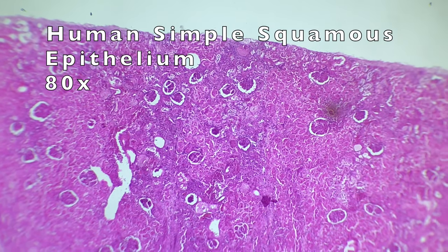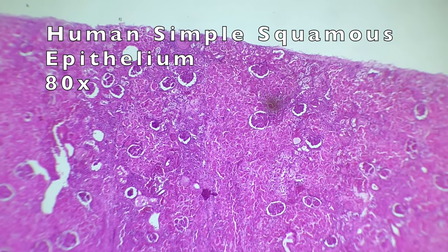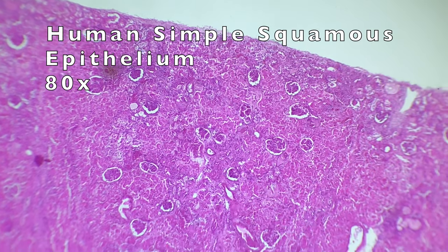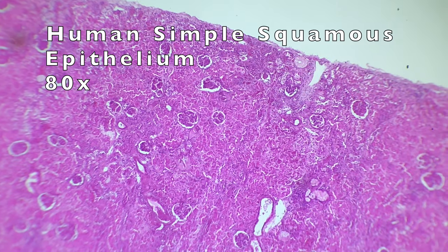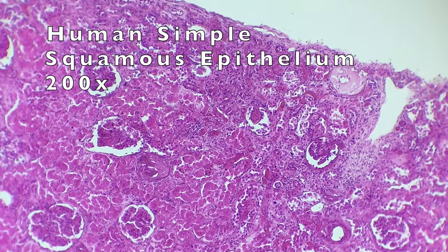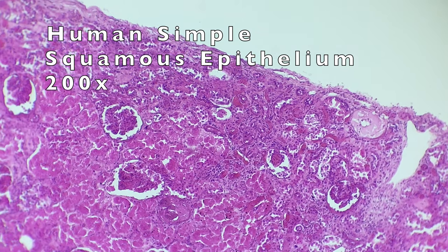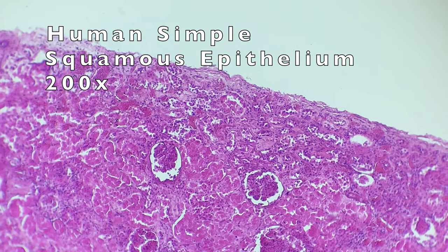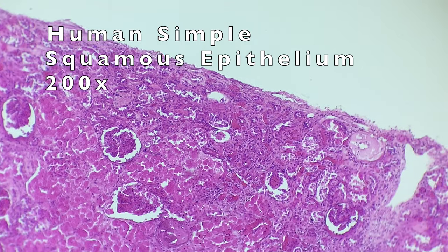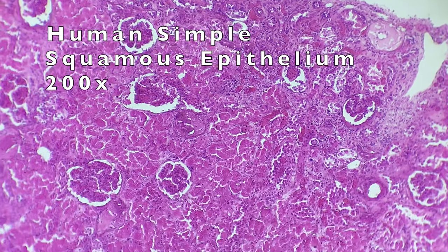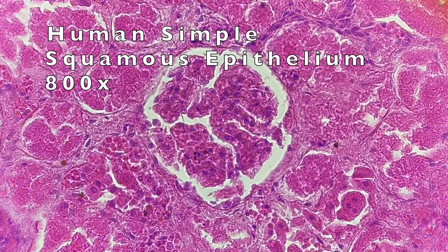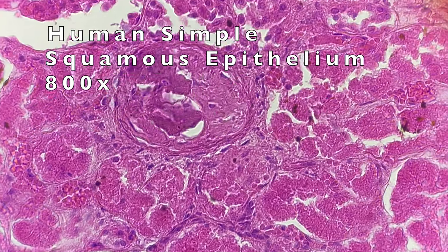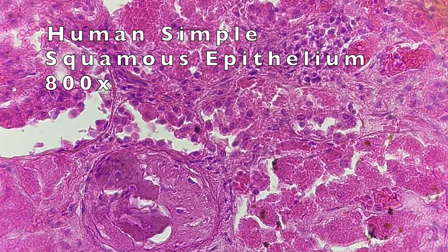Now we have simple squamous epithelium. I'm really not sure what part of the body we are looking at here. Simple squamous epithelium can be found in the lungs around the alveoli, but that can't be what we're looking at because there would be many open gaps. It's also found in the kidney, but this looks vastly different from the kidney. Around this central structure with the gap around it, that is where we would find the simple squamous tissue.